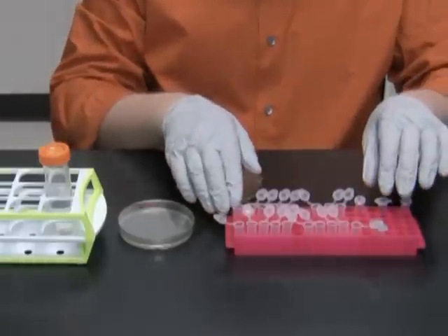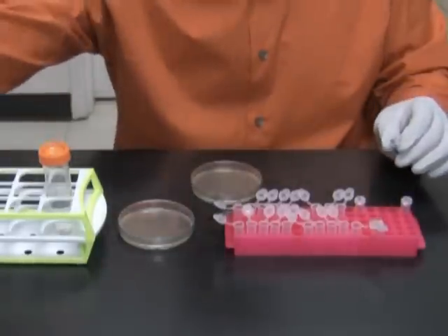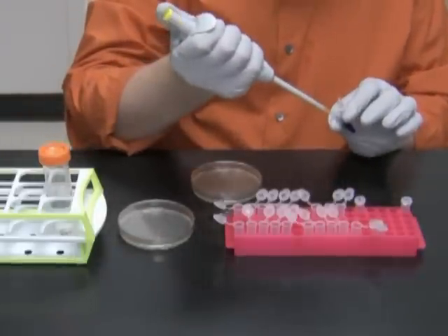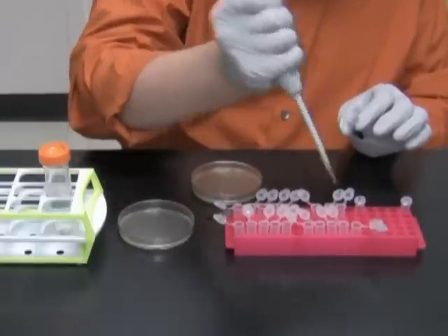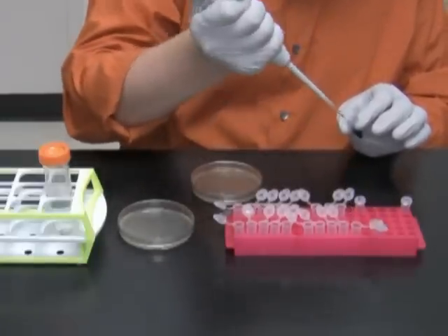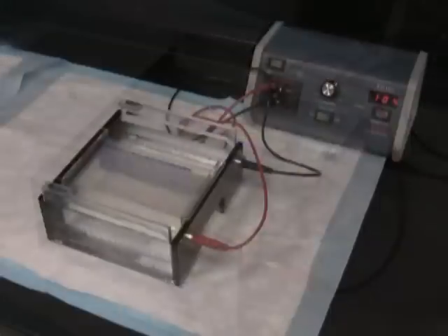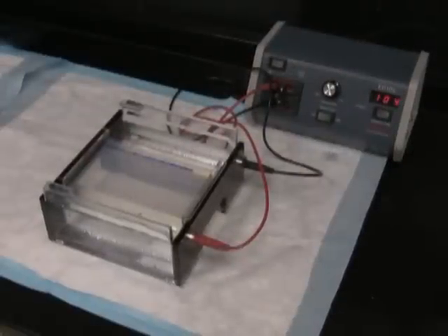I immediately proceed with adding 20 microliters of loading dye with bromophenol blue and glycerol. I load the contents of each of the tubes on a 0.7% agarose gel and run it for 1 hour at 105 volts. Notice that for the cracking gel, I am using 0.7% agarose, which allows for better separation of large DNA fragments.